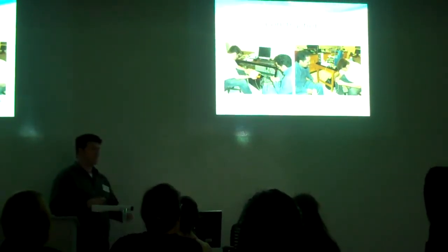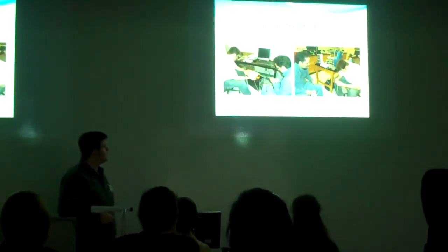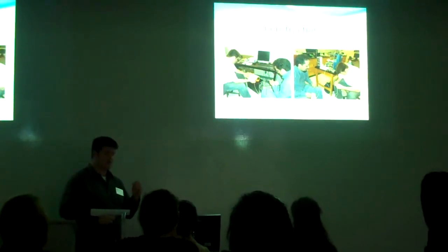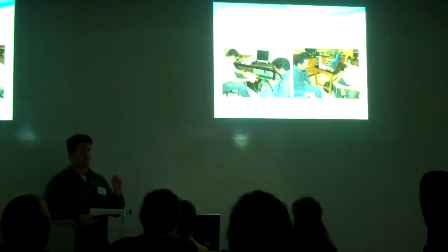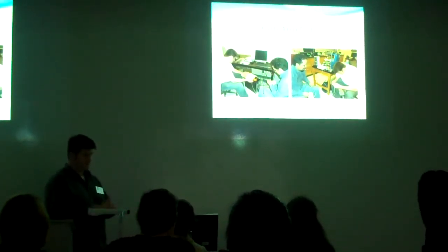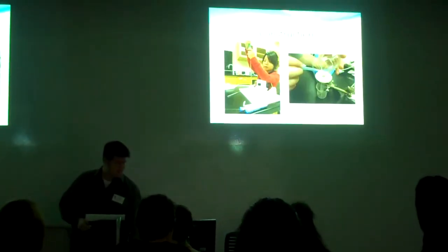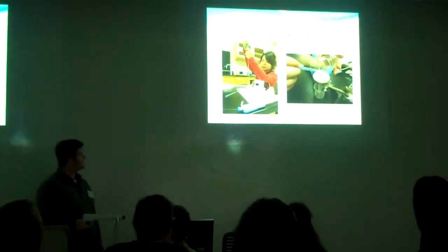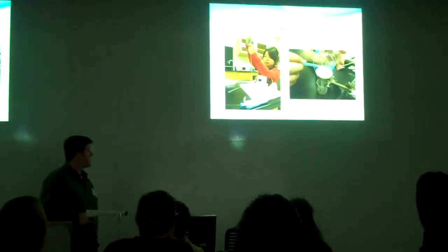In the construction, we had to do a lot of these components by hand. It was one of the big challenges we faced, including the cables connecting the luminometer to the computer, and the cables connecting the signal generators to the pumps, which had to all be made by hand or refitted from cables that already existed. That was a difficult challenge, but it worked out. And this is a construction of the stoppers. This is my laboratory assistant, Stephanie Yu.